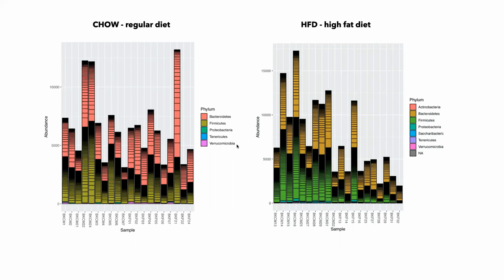Another important aspect of what you want to look for is that this contains a number of different samples. Here you can see that some of them are BKCM, which is cecal samples, and then BKF. F stands for fecal samples. In fact, we have these BKFs and BKCMs. Here, for example, this is very obvious for a high-fat diet: the BKCMs are on average higher than BKFs.